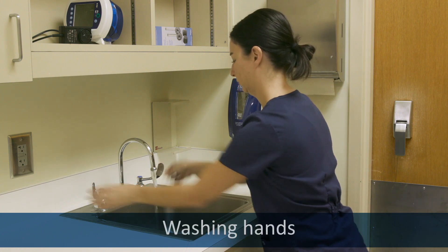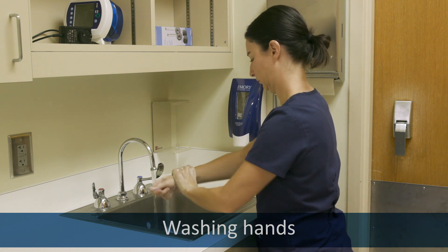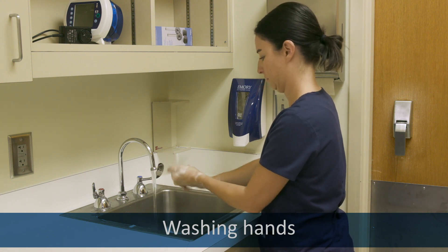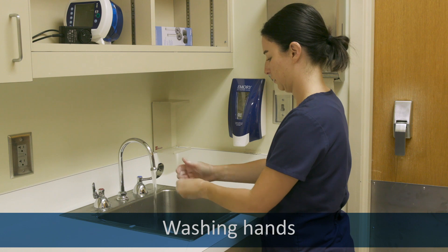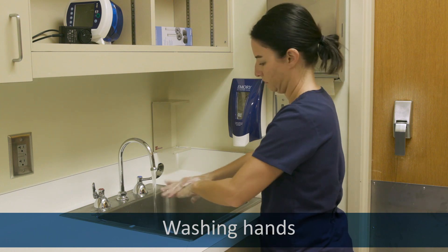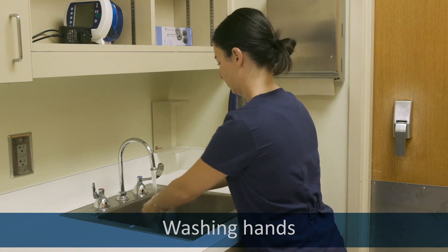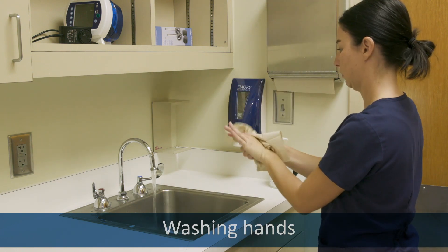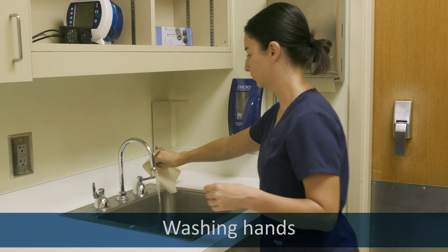Now thoroughly wash your hands. Turn on the water to a comfortable temperature and use plenty of soap. Wash your thumbs and fingernails and in between your fingers and your forearms. Rinse off the soap and use paper towels to turn off the water and dispose of them.